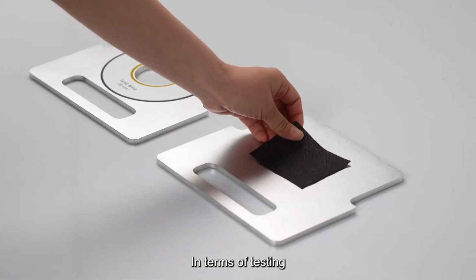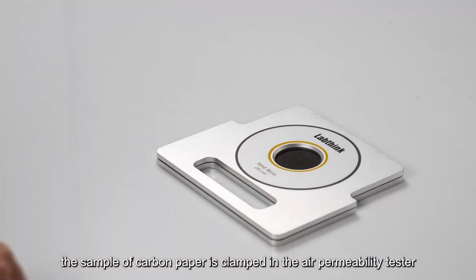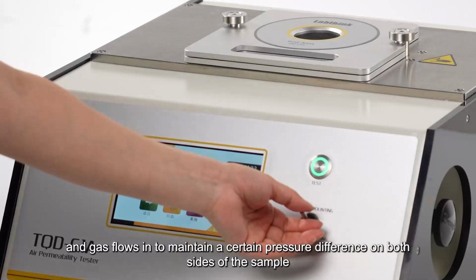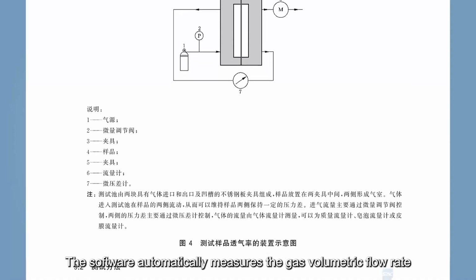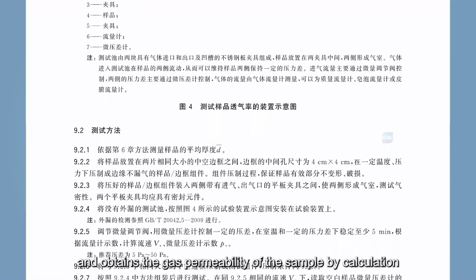In terms of testing, the sample of carbon paper is clamped in the air permeability tester, and gas flows in to maintain a certain pressure difference on both sides of the sample. The software automatically measures the gas volumetric flow rate and obtains the gas permeability of the sample by calculation.